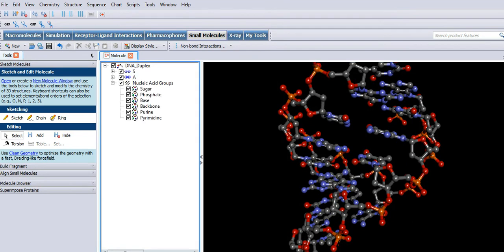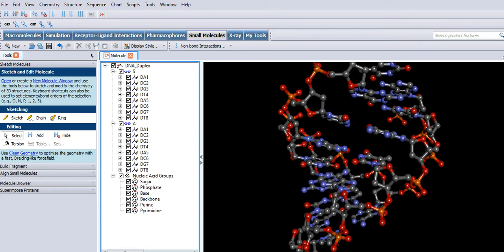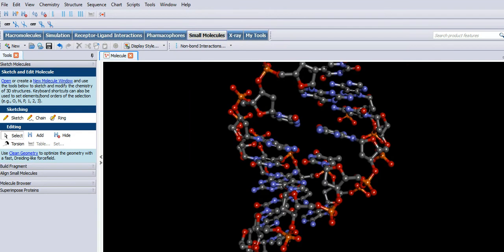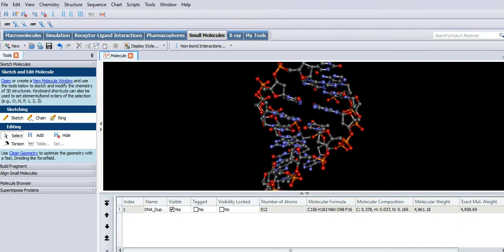Everything you need there, okay? And similarly, at the bottom of the screen, more information there.